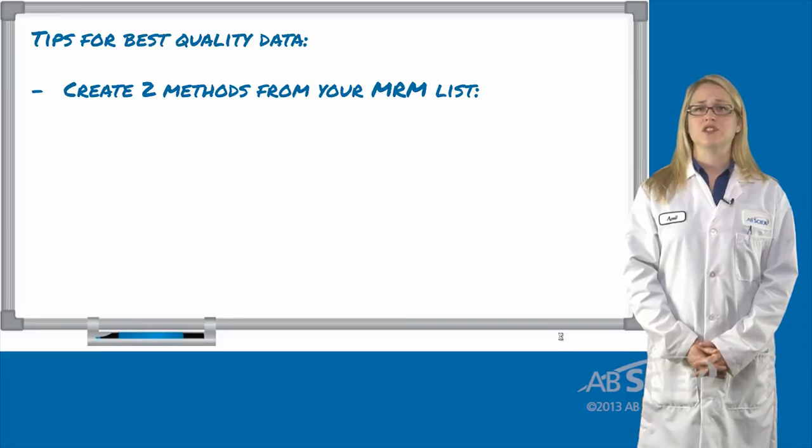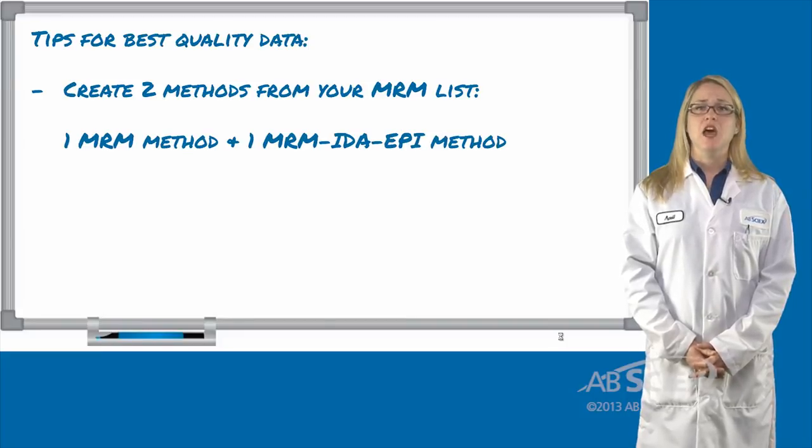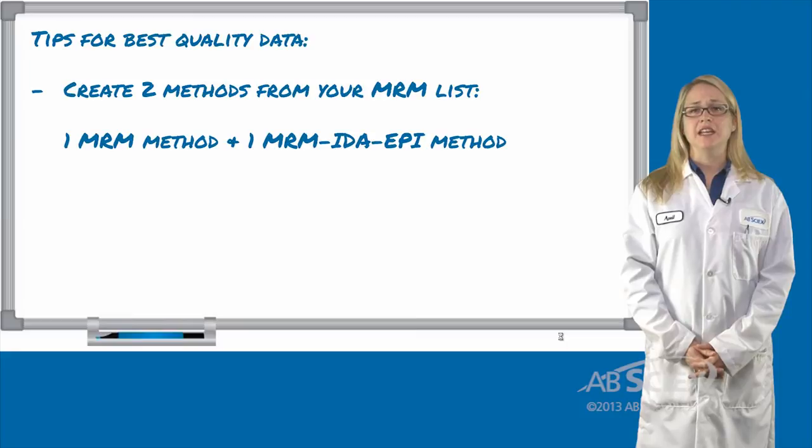it's always best to create two acquisition methods, one basic MRM method and one MRM method with added IDA EPI.